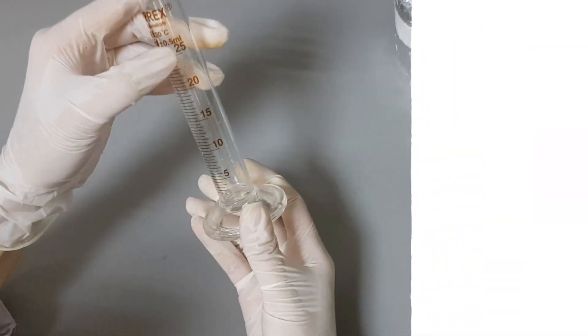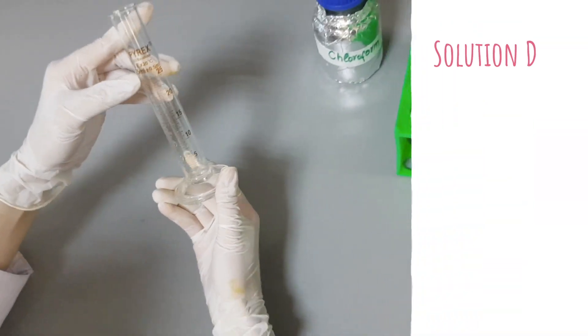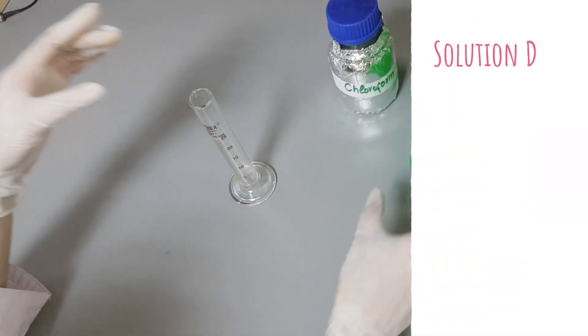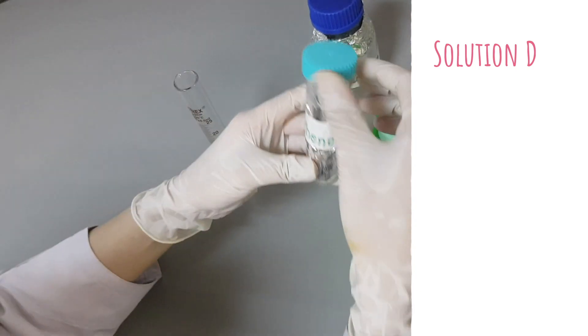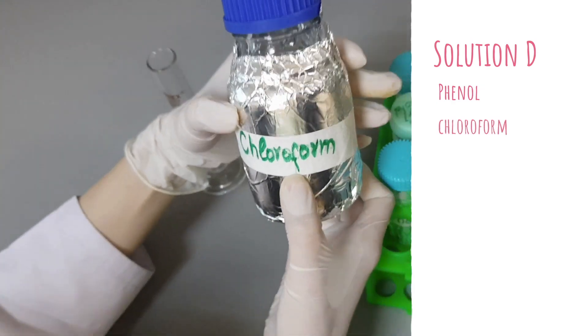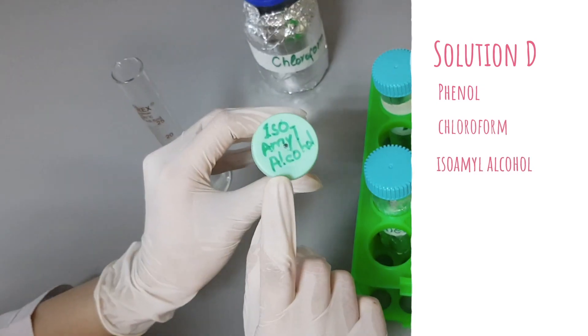Now the next solution is solution D. PCI is also known as solution D and it is composed of three reagents: phenol, chloroform, and isoamyl alcohol.